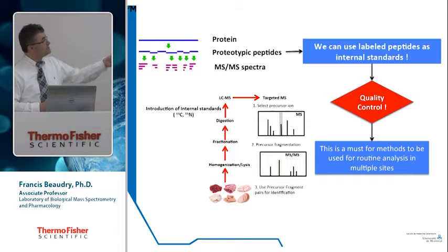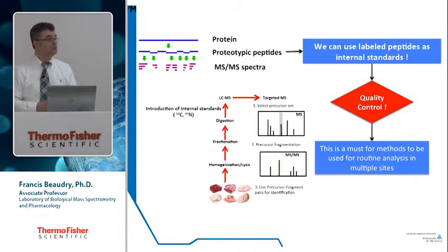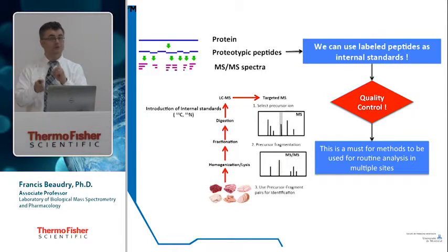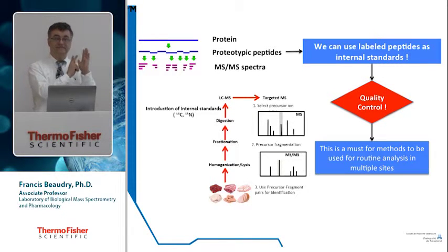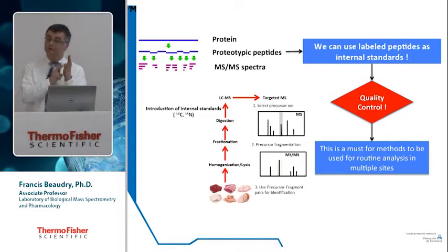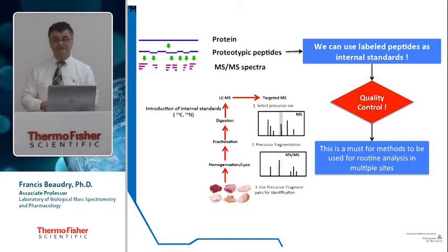This is very interesting because either you can use it as an internal standard or you can truly use it as a quality control measure. So you can add it to your sample and follow the doublet all the time. So you have both spectra from your internal standard and the peptide you target in your sample. So in terms of mass, you always have a doublet of mass that you can follow. Strategically, you need to put your label to follow this doublet of mass. So it's a double confirmation measure. That is very good. And it's a true quantitative measure. So this is very interesting.